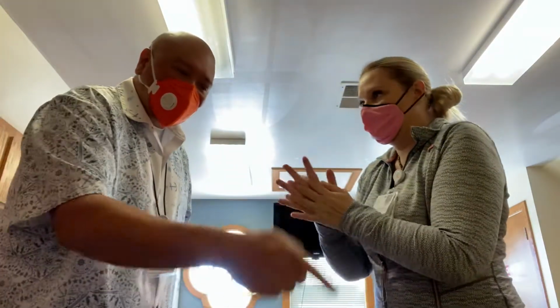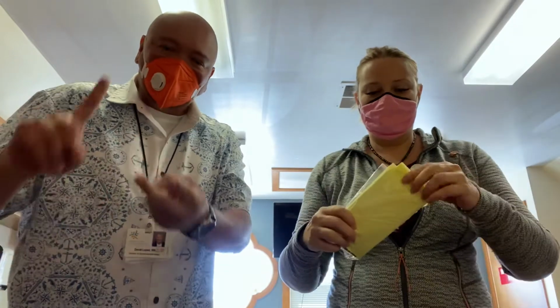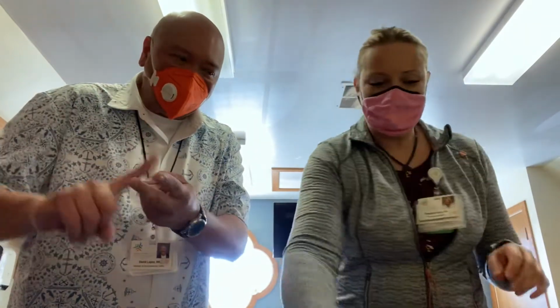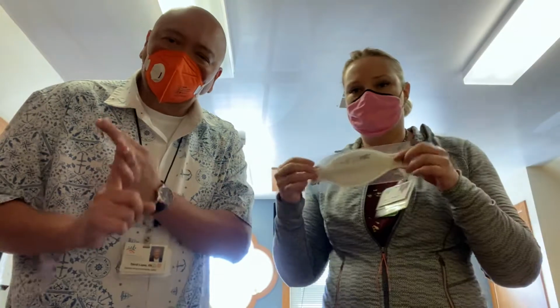The next step that we're going to work on is checking your PPE requirements. So first you will have your gown. Fluid resistant gown is preferable. Number two is you have your face shield. Number three is you have your N95. Now, when you're dealing with aerosol treatments or COVID, you need to make sure you wear the proper N95.